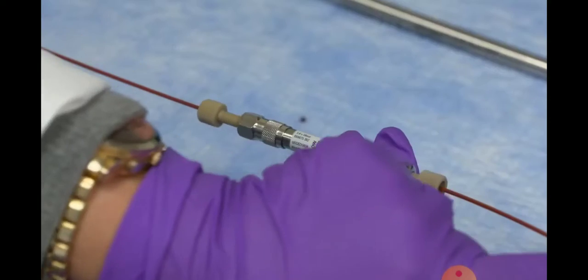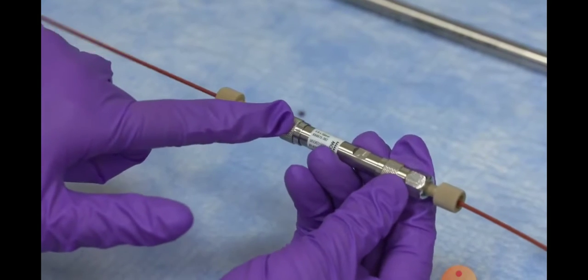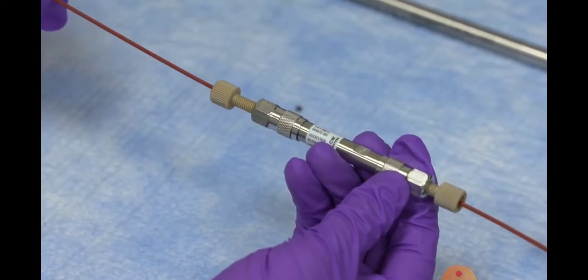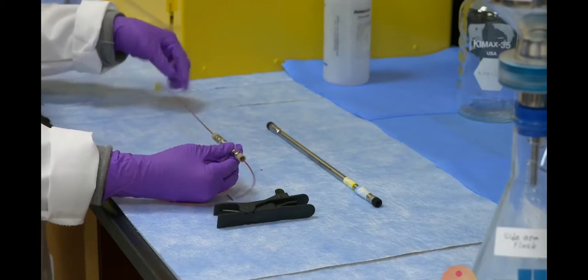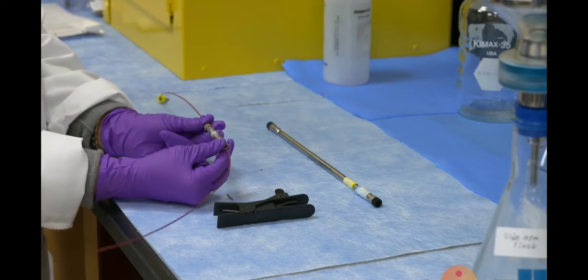Once the flow of solution comes in, it comes out from this end of the ferrule out to the detector for it to be analyzed. Now this column is ready to be installed in the HPLC system.